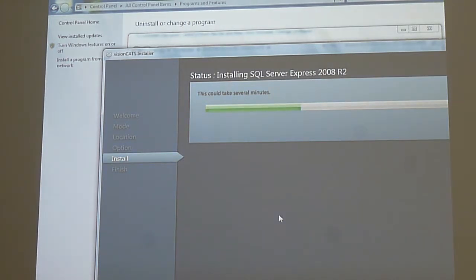He did a backup, but he stopped it in the middle of the backup. Therefore, the backup was not done correctly. Therefore, usually, if I go to the customer, I do a backup on my own, just to be sure that I have a backup. I ask, do you have a backup? And if they say yes, okay, fine. Then I do a backup on my own.